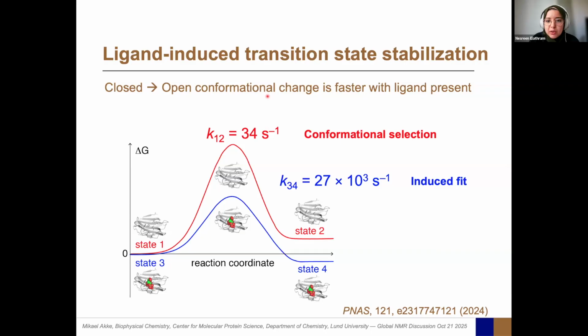did you assume that state 1 and 3 have the same energy? That's just arbitrary. Yeah, sorry. I tried to say that the actual scales here and where they're positioned is just a depiction. But just to put them as a reference point, state 1 and 3 in the same position, then you can see the differences in the barrier heights a little bit better. Sorry if that wasn't very clear, but it's clear that they don't have the same free energy. They shouldn't. Okay, nice.